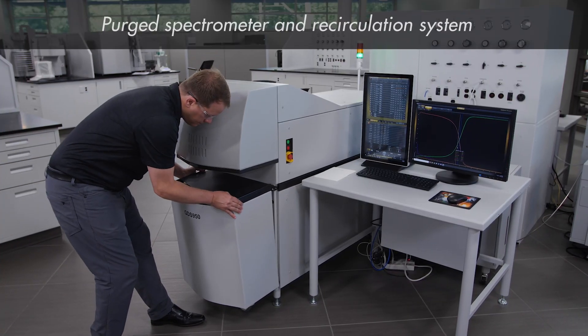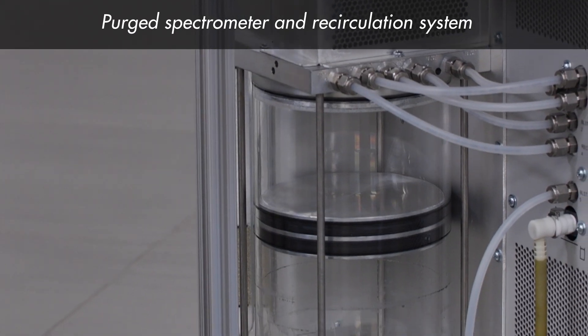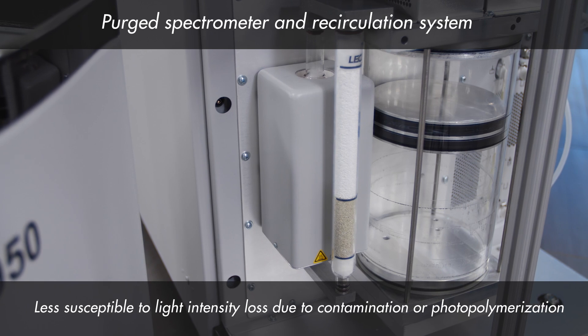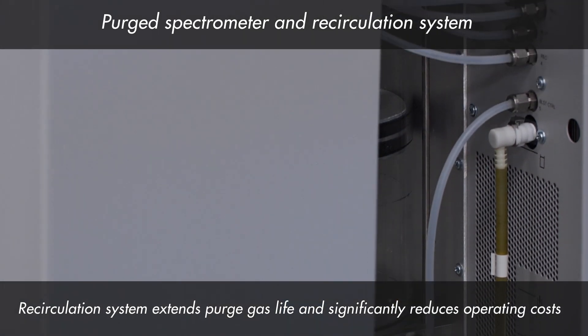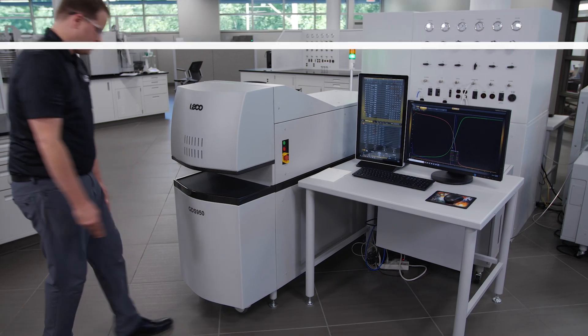All GDS series systems are equipped with a purge spectrometer and recirculation system. A purge spectrometer is less susceptible to light intensity loss due to contamination or photopolymerization. The recirculation system cleans and recirculates the purge argon to extend purge gas life and significantly reduce operating costs.